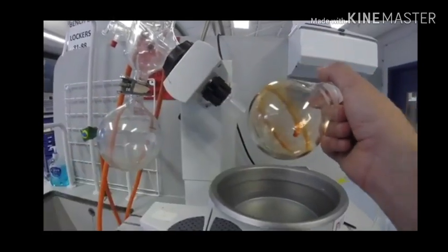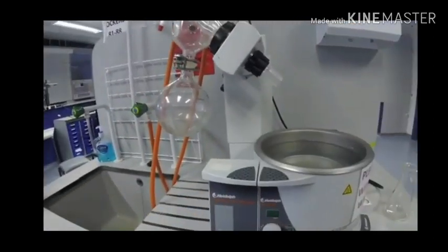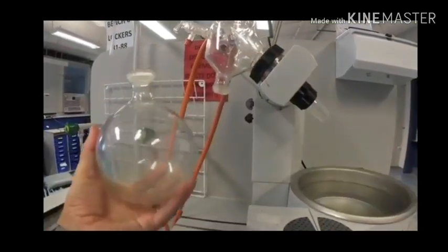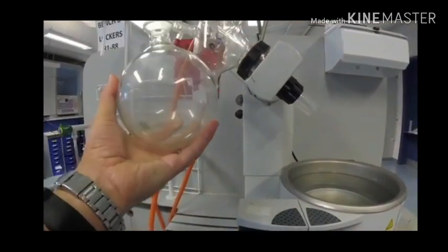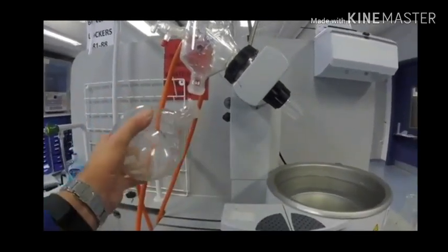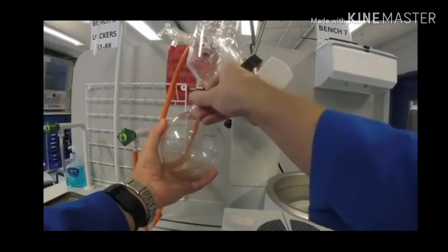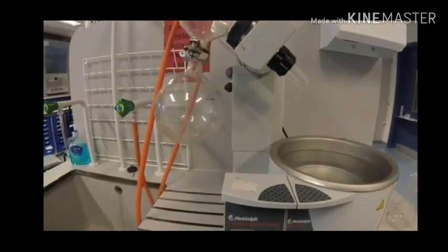Final thing to do then is switch off, and then take the receiver flask, unscrew, remove this, and if there's any solvent in here, there isn't in this case because DCM is very low boiling and the house vacuum is very high. It's a very good vacuum. But it's to make sure you do empty anything that you've collected in the receiver flask out of here. Put this back on, tighten the screw, and there we go.